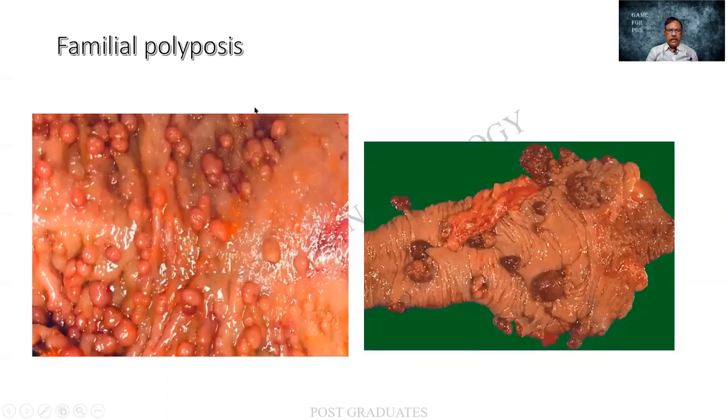And this is our class on the familial polyposis we had seen. I told you that there is a 100% chance of a malignancy, and which of these polyps is going to turn malignant, we do not know. As a result, the endoscopist and the surgeon will be scrupulously following it, and whichever becomes larger and develops some kind of a pleomorphic appearance will be biopsied and then sent to the pathologist. In fact, here it is the endoscopist who makes the first diagnosis and not the pathologist.